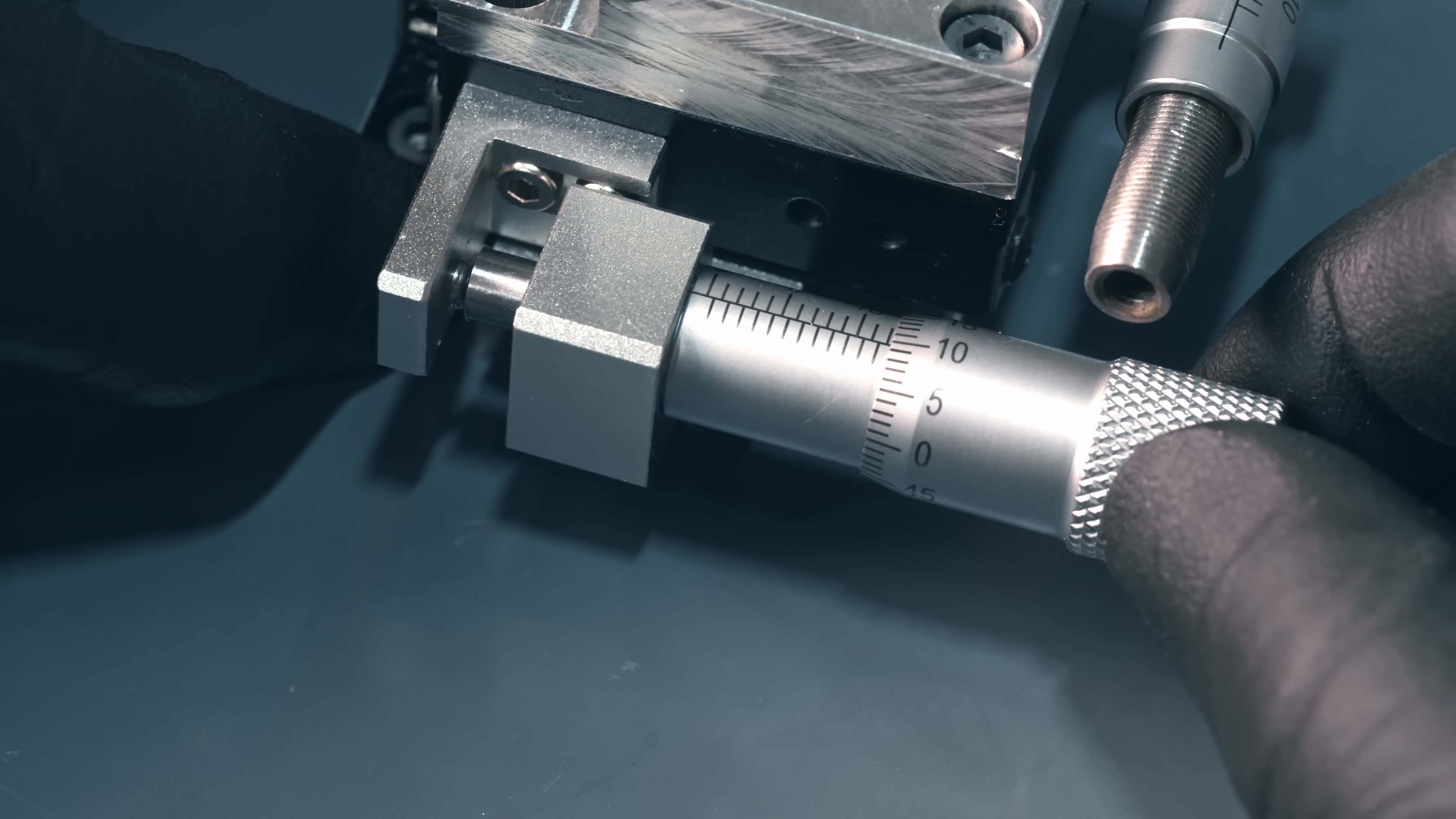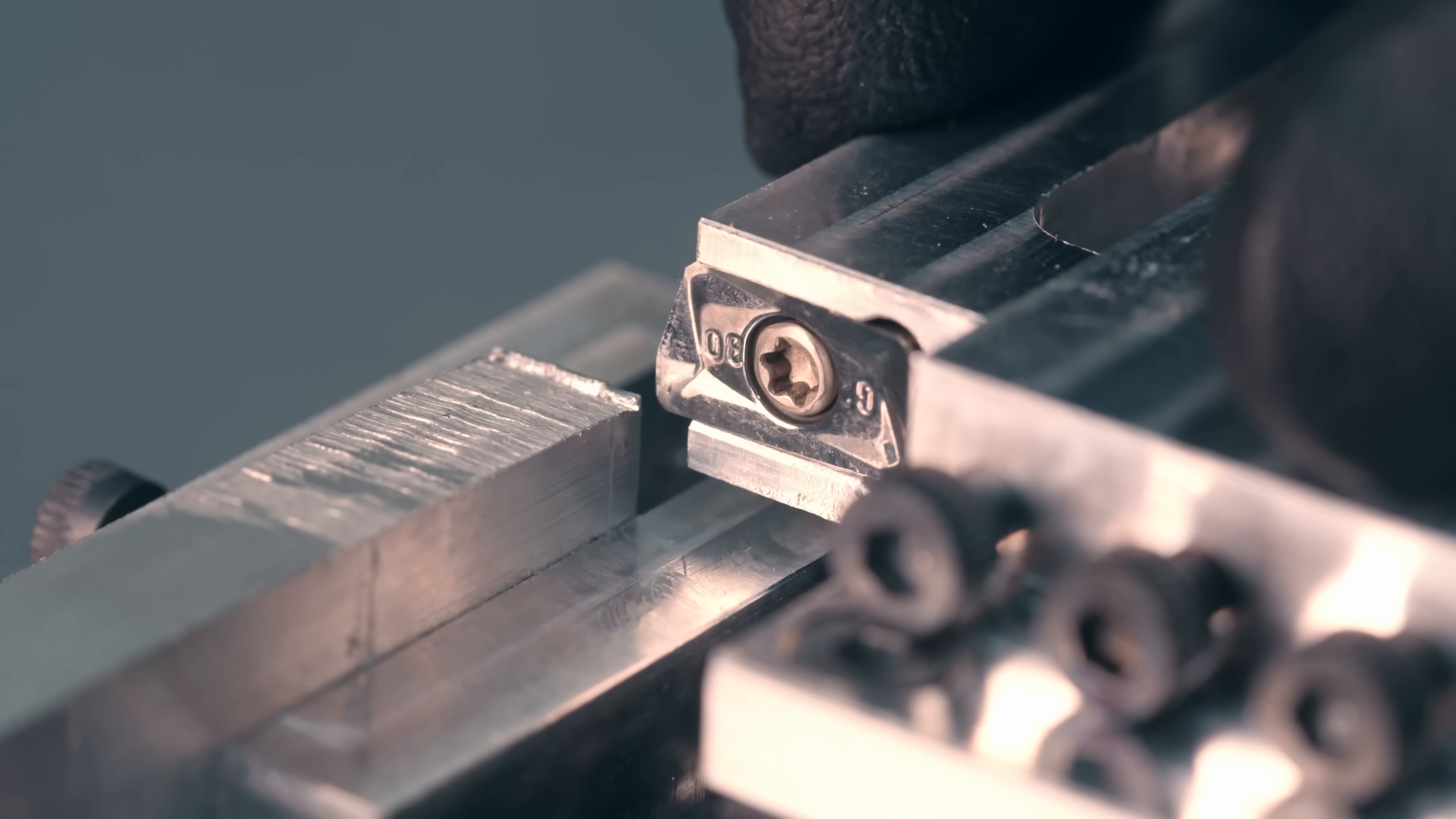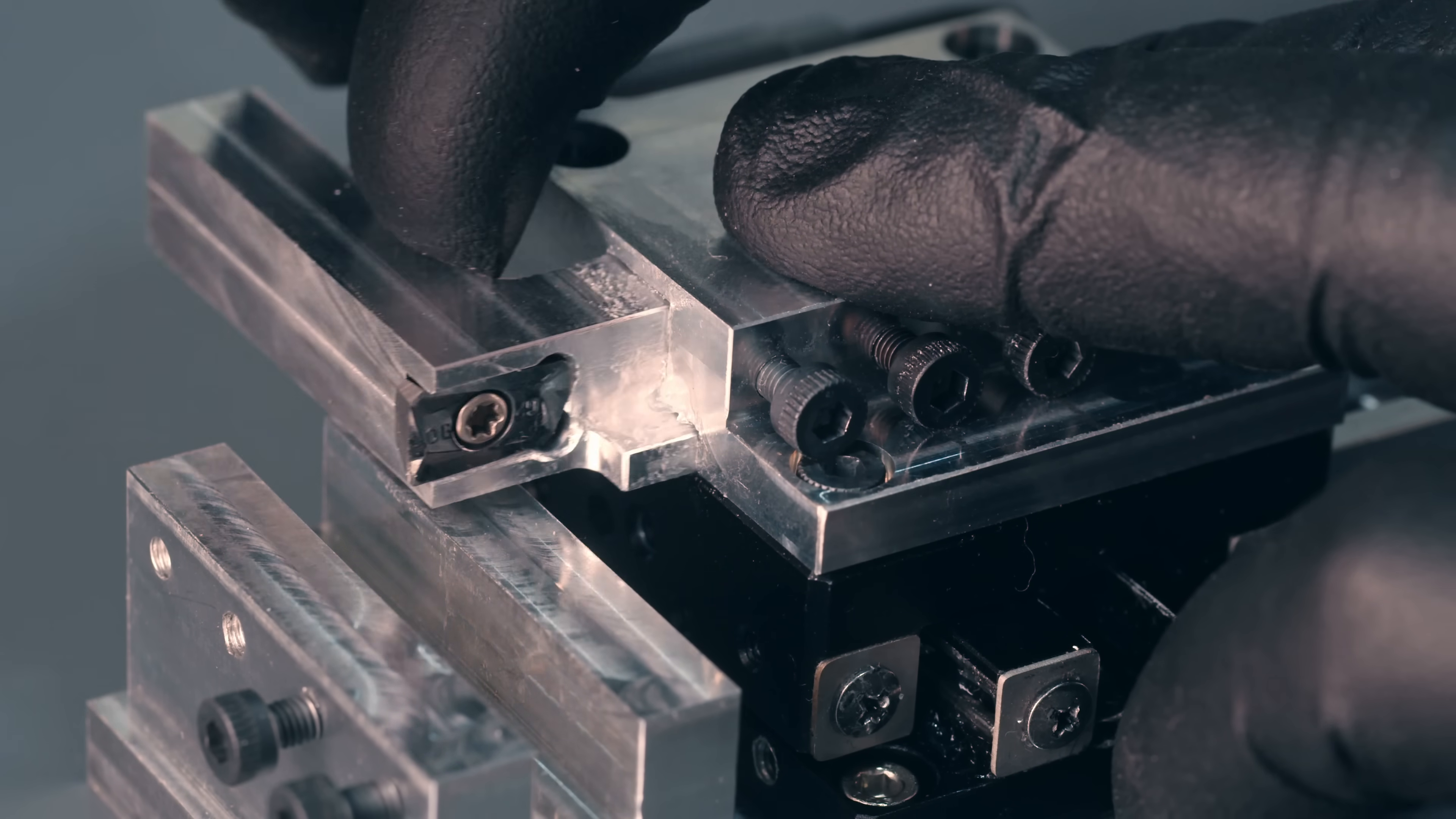It uses an off-the-shelf linear stage which provides the cutting motion. That mounts onto a base which also acts as a vise holding our material to be cut. And on top of the device is the holder for the carbide cutter which also allows precise positioning so we can adjust the depth of cut.